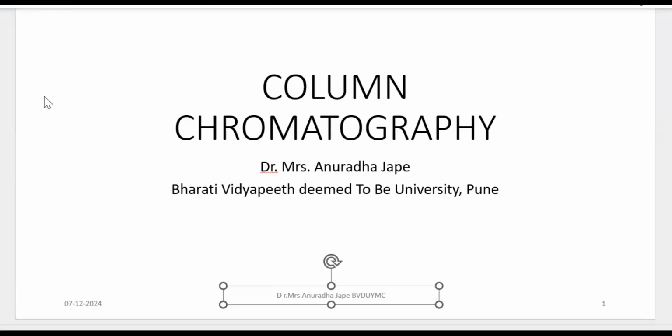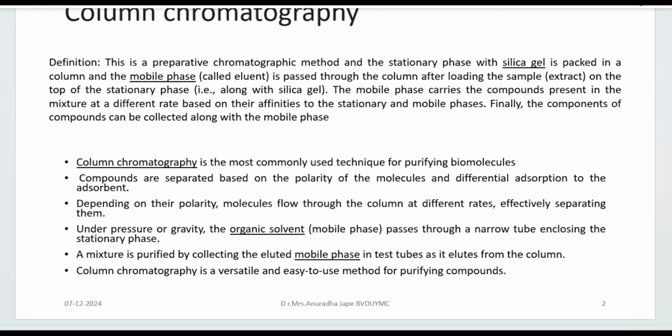So column chromatography is the topic for today's discussion. As we go to the principle and working or definition, surely it is about preparative mode of chromatographic separation. So we have stationary phase, we have mobile phase, as we had in the case of TLC or paper chromatography.